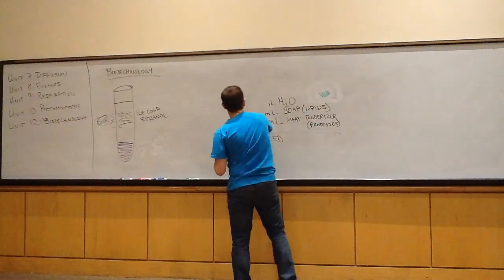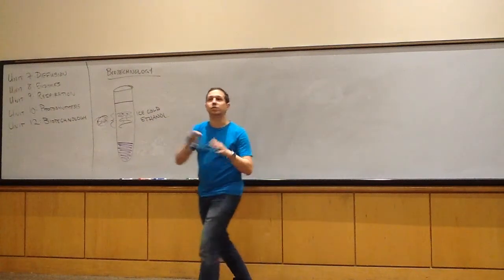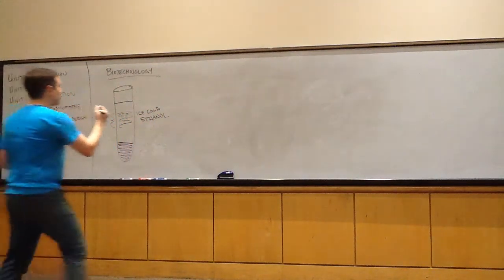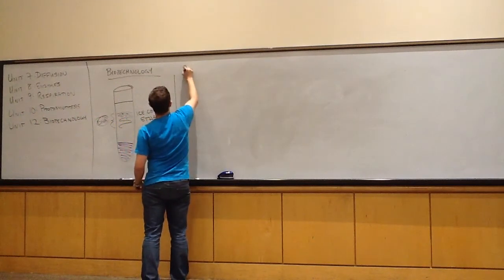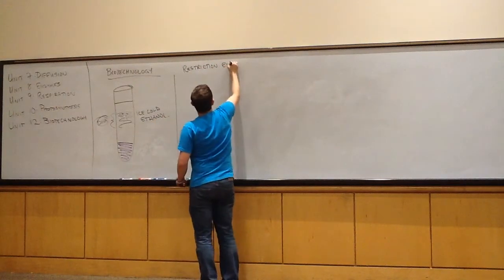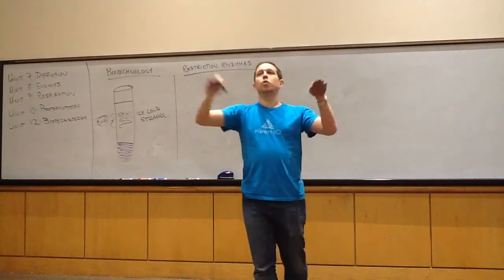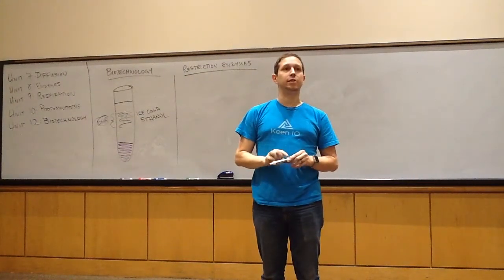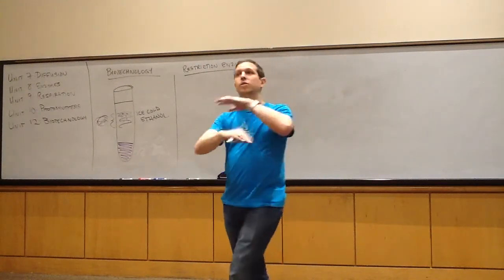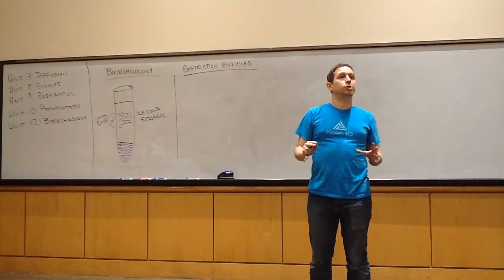After we isolate our DNA, the next thing we have to do is start trying to establish differences between different people. To do this, we're going to use a class of enzymes called restriction enzymes, or restriction endonucleases. Let me explain what these are. These are enzymes that recognize certain sequences of bases in your DNA, maybe AAA TTT with its complementary strand of TTT AAA. Okay? So they recognize distinct regions.